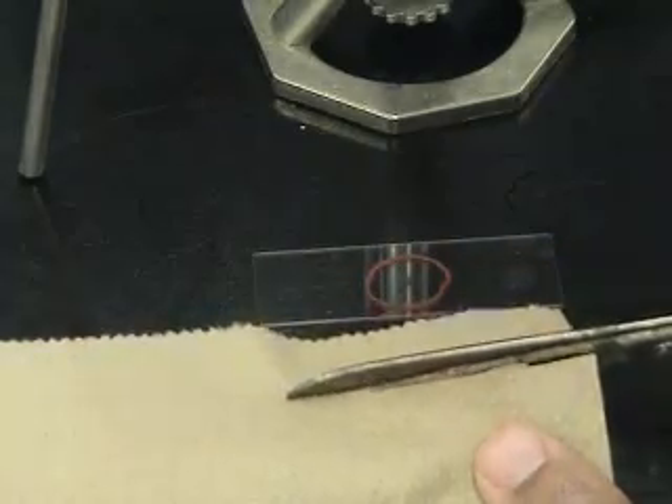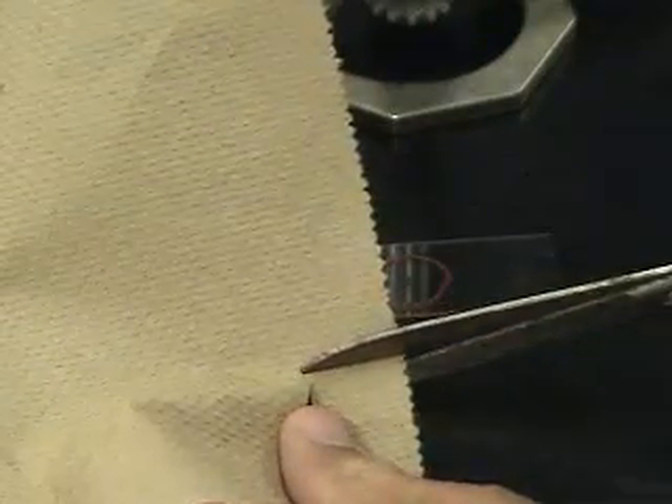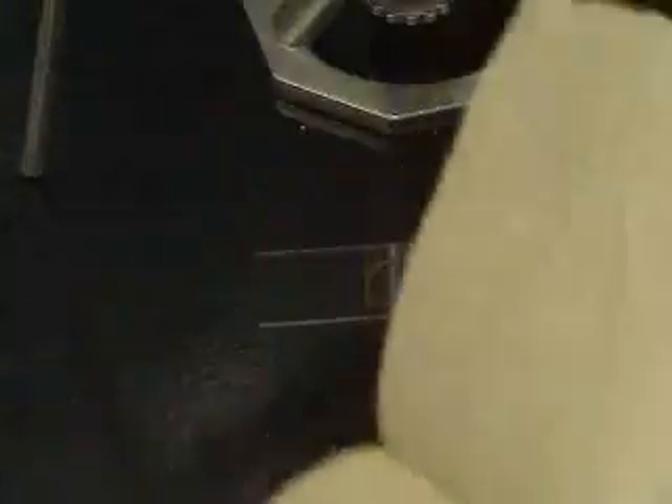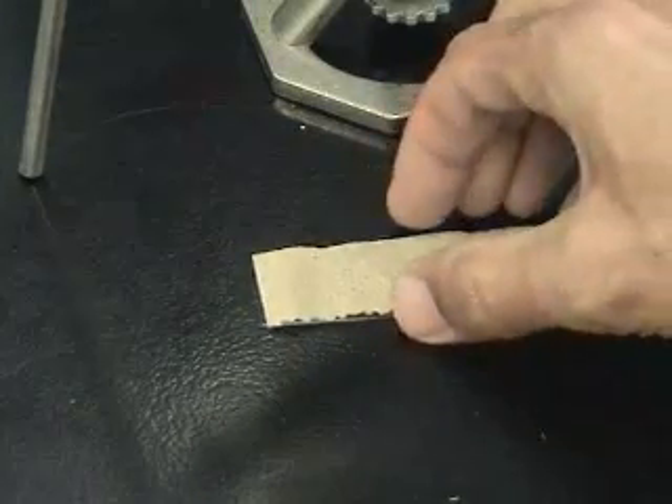A paper toweling is cut to a dimension larger than the smear, but smaller than the edge of the slide. This allows a large amount of stain to be placed on the smear and prevents the stain from drying out.